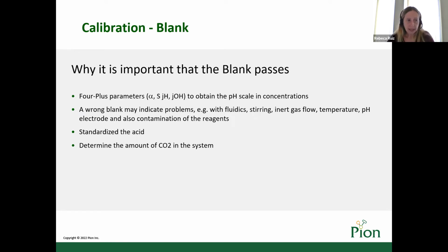Secondly, a bad blank may indicate problems, for example, a blockage in the capillaries, a leak in the syringes, stirring problems, low inert gas flow, problems with the electrode, and also contamination in the system. Blanks are also important as they standardize the acid and determine the carbonate levels in the system.